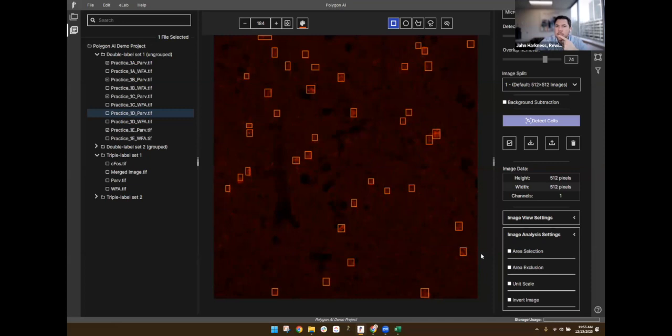Certainly the model learns best from seeing examples of what you want it to detect. I couldn't guarantee that, for example, if you trained a model to only look at cells in the hippocampus and you showed images that included areas outside of the hippocampus, you would not detect anything outside of there. But certainly the more examples you give it, the more accurate it becomes. That's an interesting thought. The models can learn context, so variation in the background is also important.